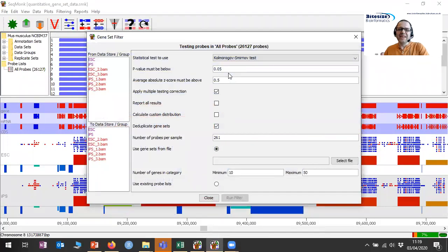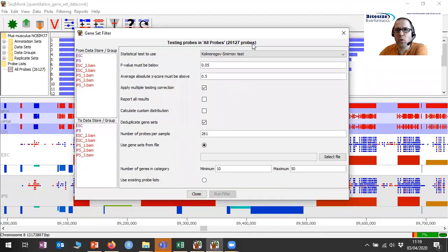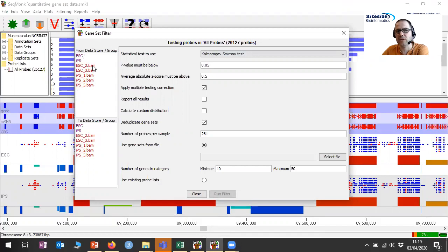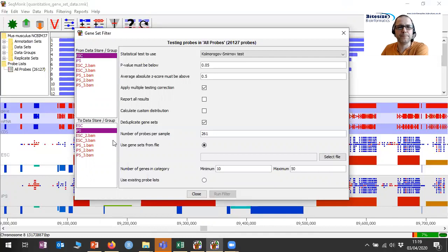We've got a bunch of options here — generally the options are fairly sensibly set. I'm going to tweak a couple of them just to show how this works. We need to tell it what comparison we want to use as the basis for the test. I've got my ESC and IPS replicate sets at the top and bottom, with the individual BAM files that went into them. I want to test the overall comparison between the two, so I'm going to select to test from ESC to IPS. It doesn't matter which way around I do it — it's just going to flip the direction, but the results will be the same.